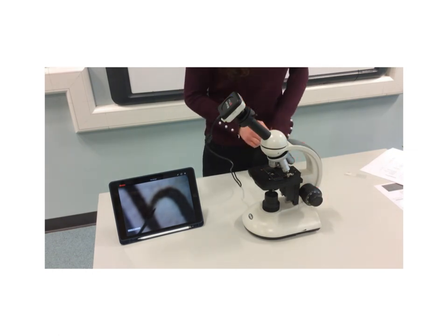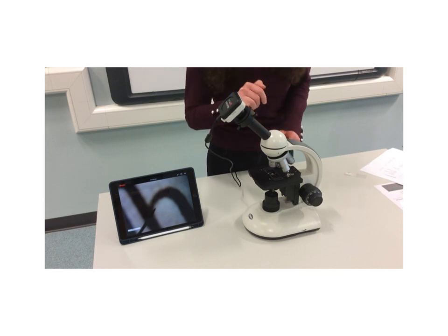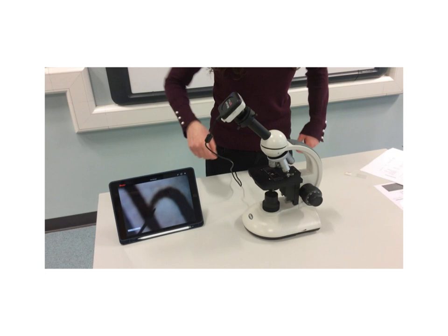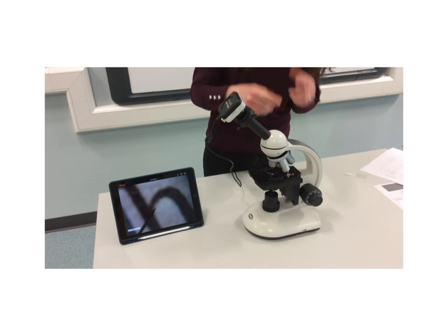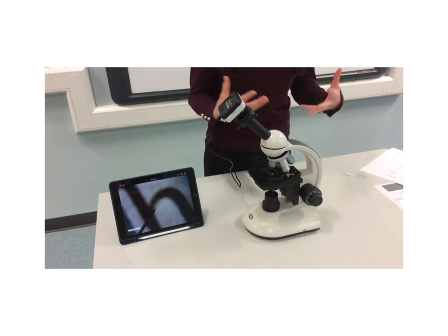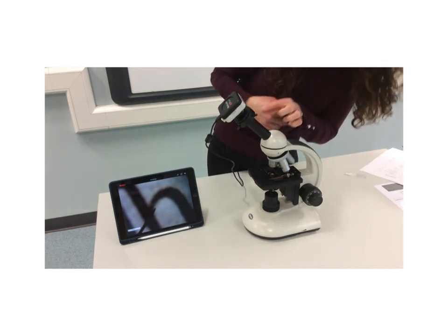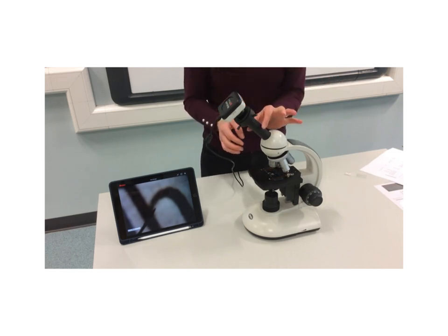Okay, then we've got our different lenses. So up here we have got our eyepiece lens. Now this is called eyepiece because it's where we would put our eye. Now we've got our camera here instead today, but normally we would look into the microscope at this point, and this is called our eyepiece lens. Mostly they multiply the image by up to 10. So you can see here on the side it says times by 10, so that's the magnification of this eyepiece lens. So it makes the image 10 times bigger, just this lens.